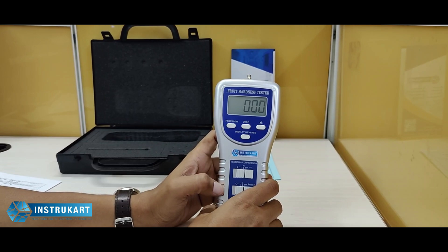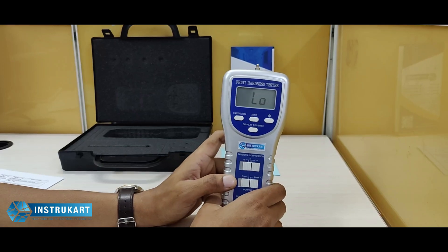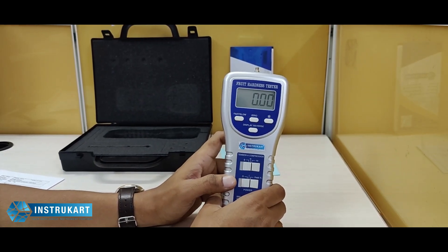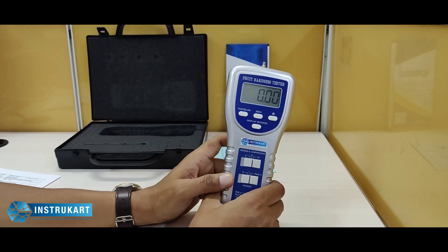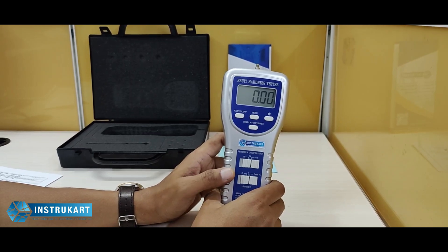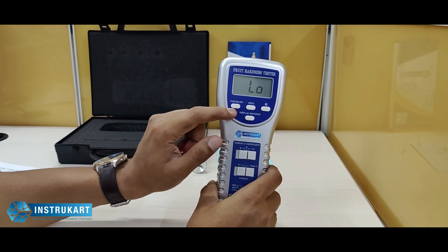For the resolution, it is 1 gram, 0.05 ounce, or 0.01 Newton. For accuracy, it is plus or minus 0.4 percent plus one digit within 23 plus or minus 5 degrees Celsius. The update time is 0.2 seconds in fast mode and 0.6 seconds in slow mode.